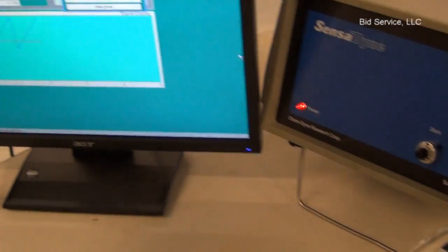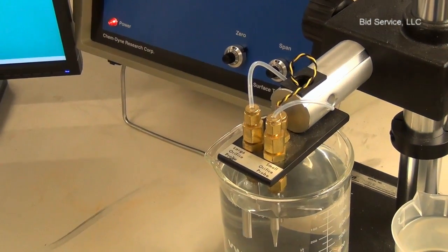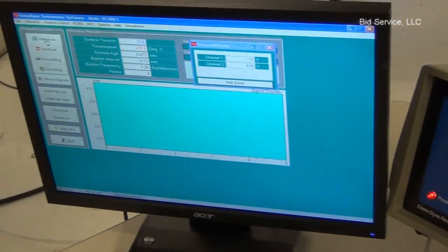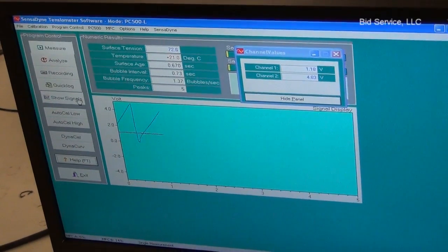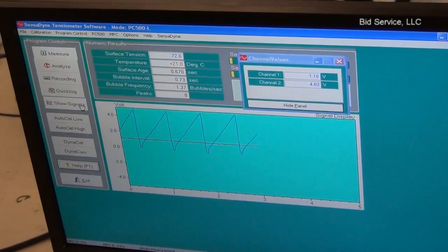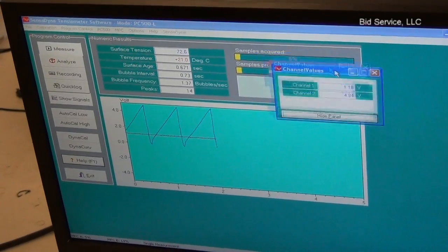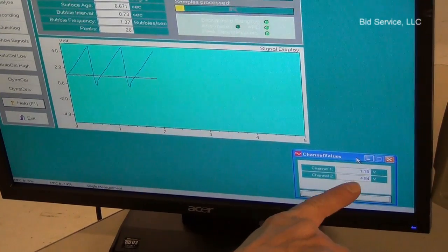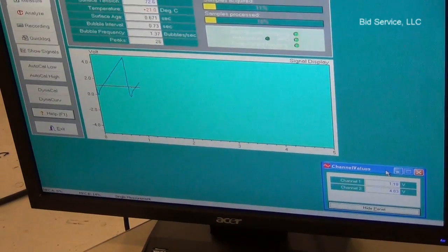We also have a temperature probe in there and we're reading 21 degrees C. There is a panel here that shows the voltage of either channel. Channel 1 is the temperature and Channel 2 is the pressure transducer.